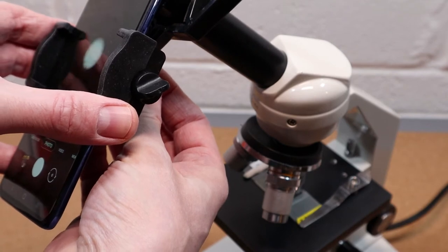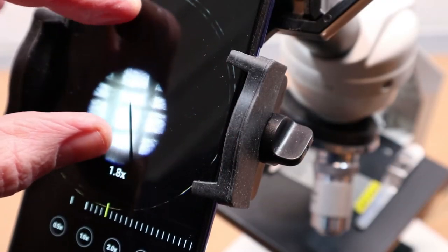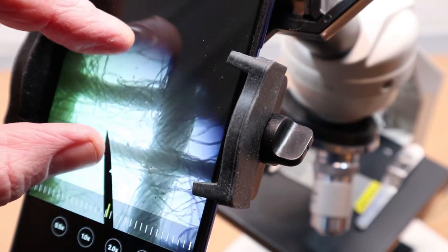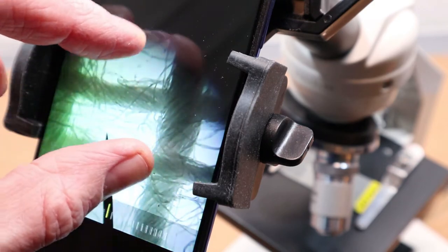You can see that the image looks very small here, but once I zoom in, it doesn't look too bad. You'll also see that the image is flickering a bit as well, but I later worked out how to stop this by adjusting the phone's exposure setting in the camera app.